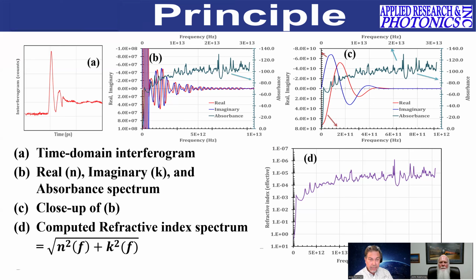And one thing I think I should note here is I have shrunk the x-axis to 10 terahertz, and I have then zoomed to only up to 1 terahertz just to show how these busy lines over here vary.